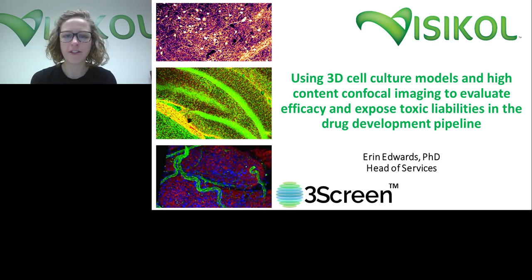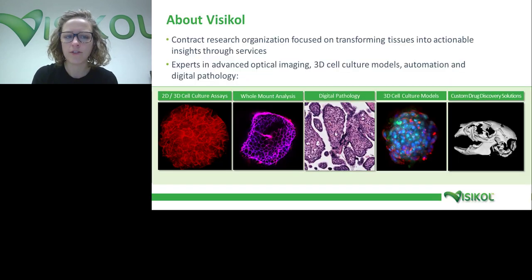And today I'm going to be talking to you about using 3D cell culture models and high content confocal imaging to evaluate efficacy and to expose toxic liabilities in the drug development pipeline. So just to give you a little bit of background about our company and what we do, just so that you have some context for where I'm coming from with a lot of what we'll be talking about today.